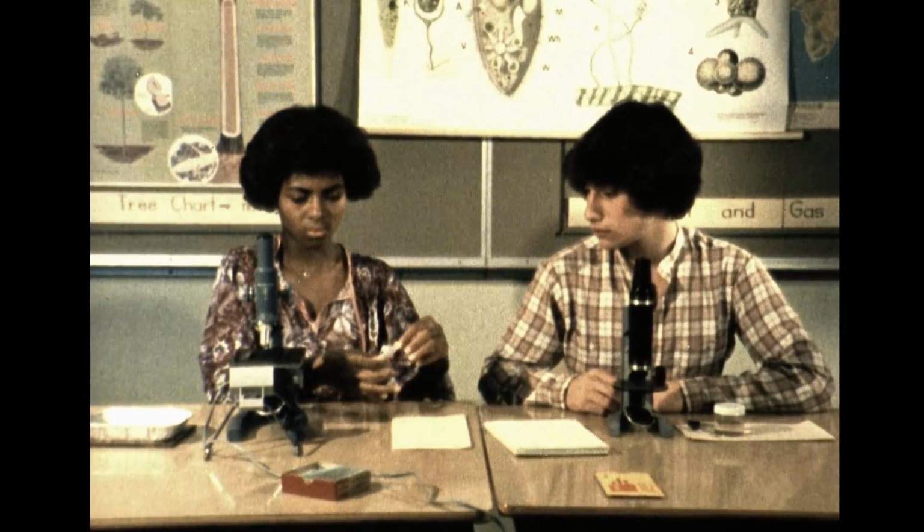Now that we are familiar with the most important parts of a microscope, let's use it. But first, we need a sample.